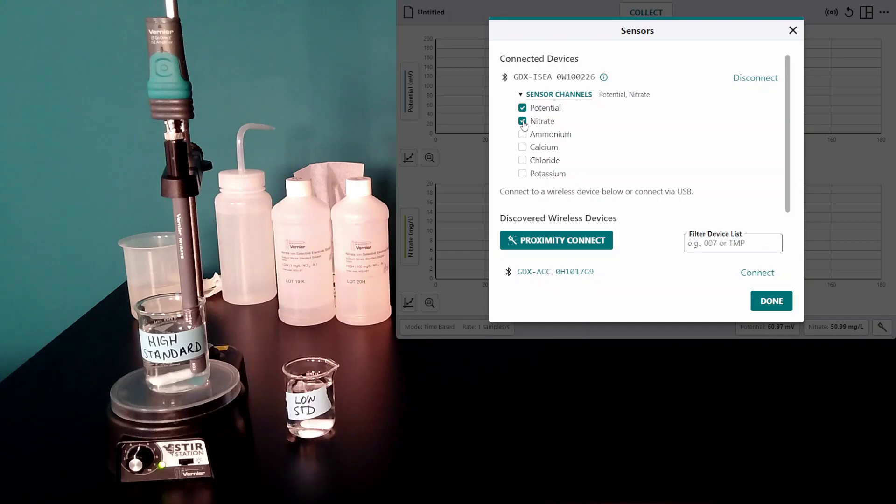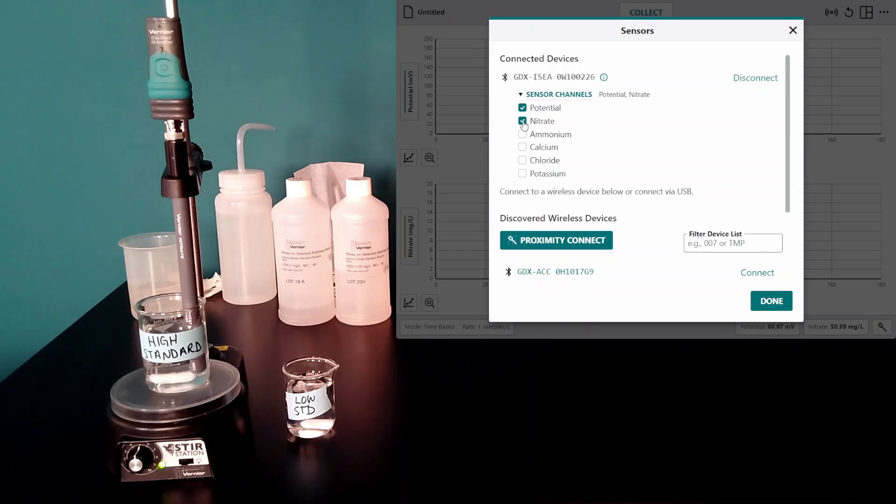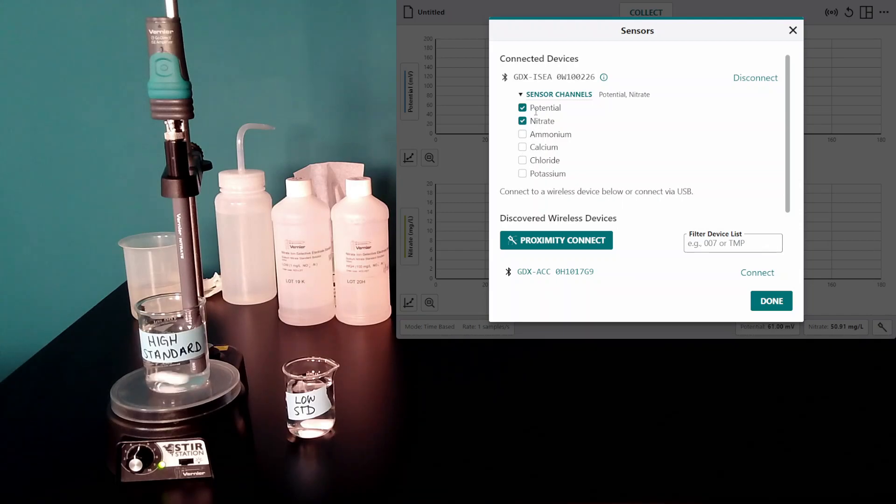If, for example, you had a calcium electrode attached, you would want to make sure calcium and potential were selected.